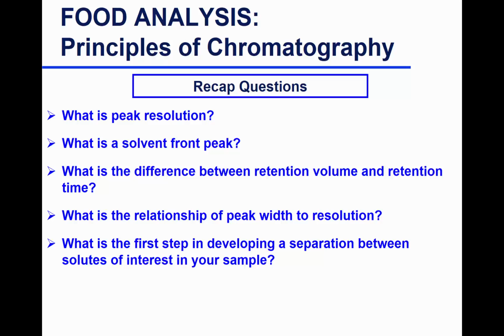Yes. So it's basically how long it took on the column, how much volume it needed to get it out of the column. And the retention time is the same thing, but here the unit is time, how long in time it took for the solute to leave the column. So you can either record retention by volume or retention by time, but often it's reported by retention time.